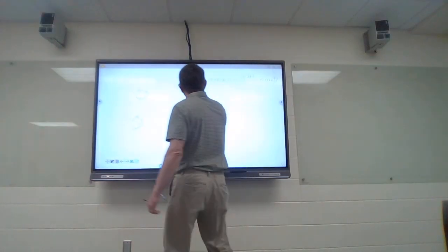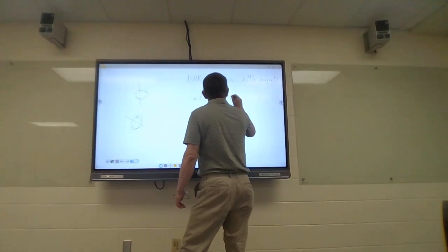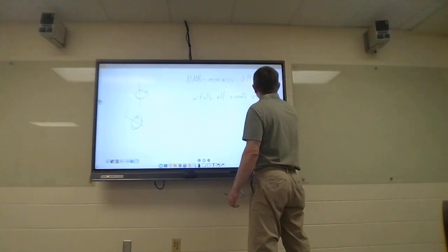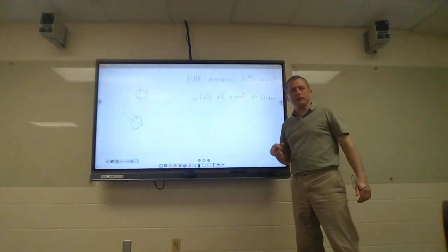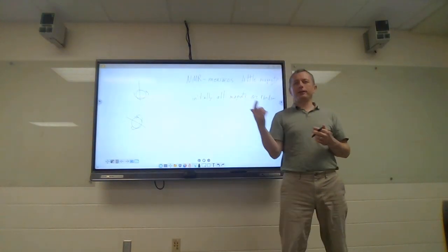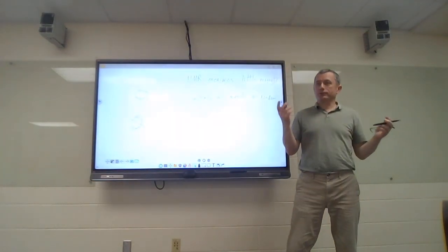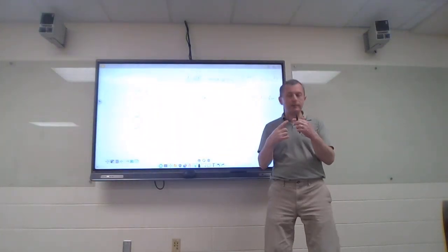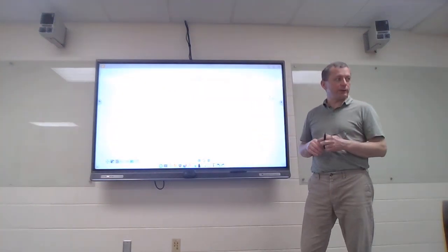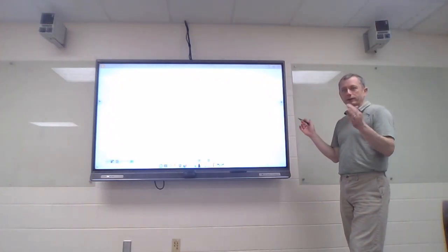So there's really no constriction on how the nucleus spins and on which axis it spins. There's nothing that orientates it, nothing that locks it in one particular spinning type of motion. And it can move around on that too. All right. So all these little magnets are pointing in a bunch of different directions.